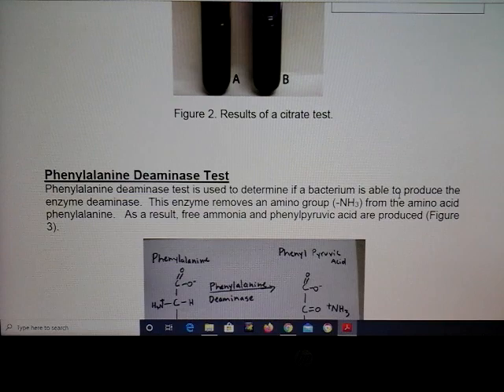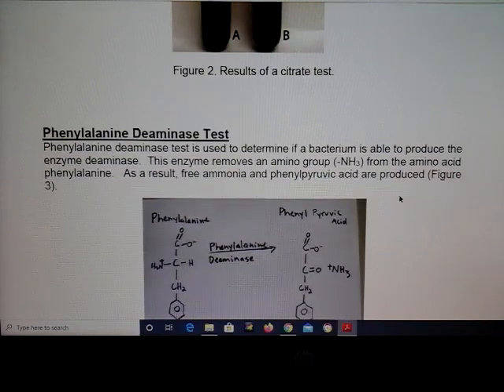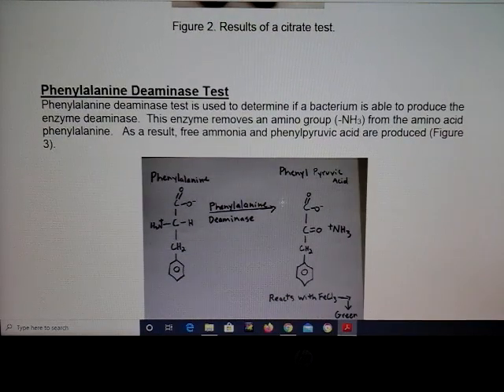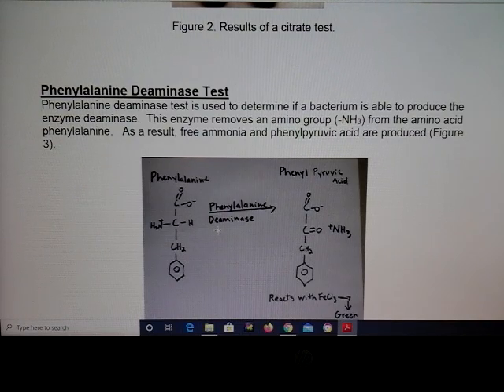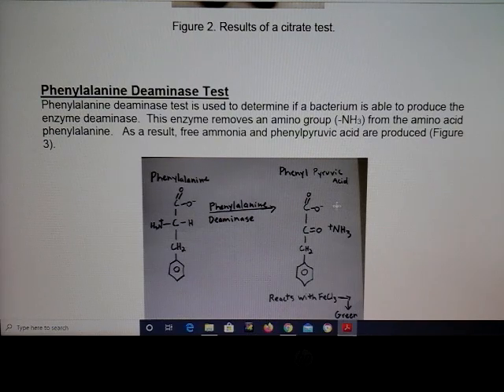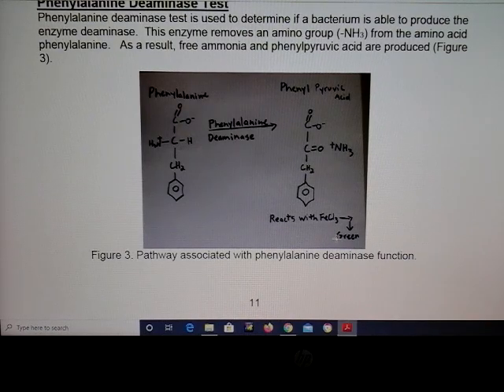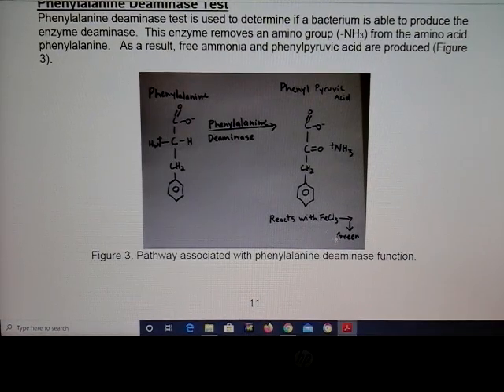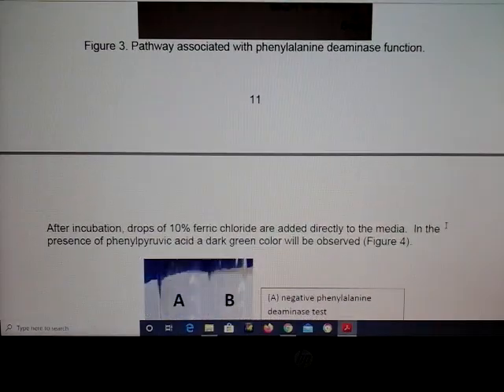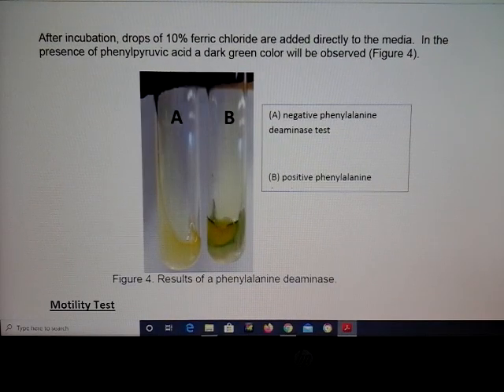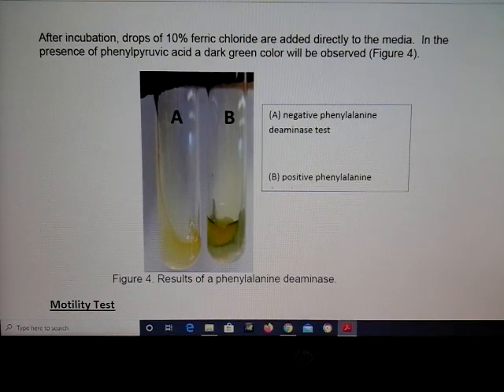With the phenylalanine deaminase test, we are looking to see if the bacteria will produce phenylalanine deaminase. It forms phenylpyruvic acid, which then reacts with ferric chloride to give a green color. This is an example of the green color you will see with the phenylalanine deaminase test.